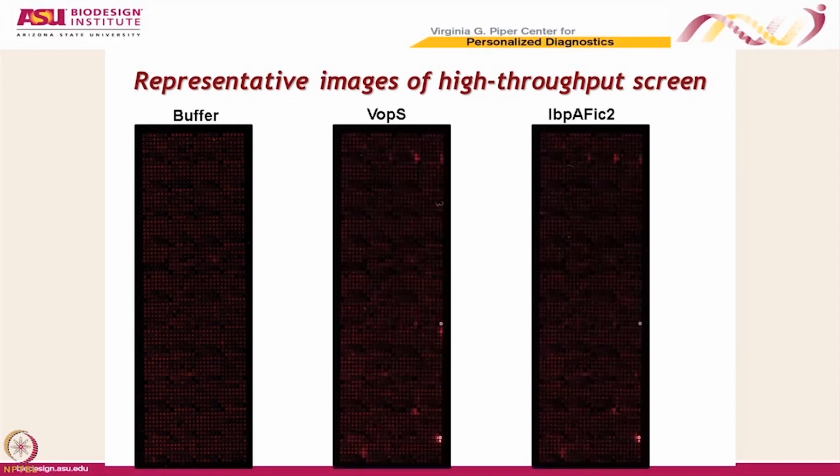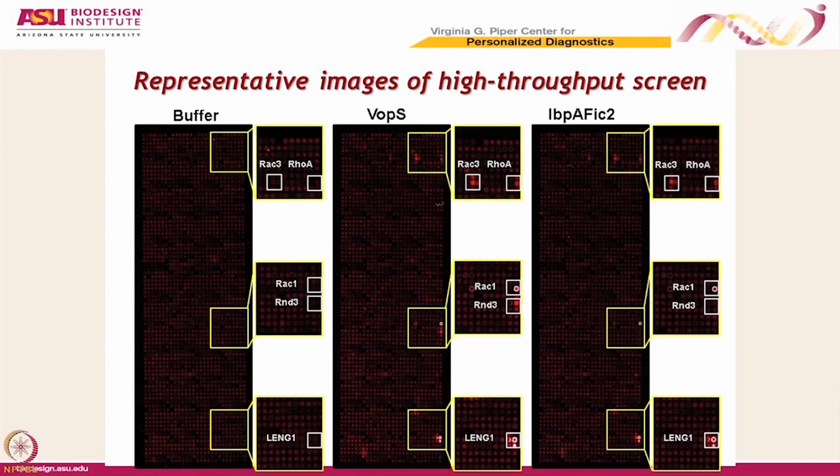When he treats with those guys, can you see that? All of a sudden, a few, not very many, but a few spots, like these guys right here, start lighting up. That's kind of the result that you're hoping for, right? When you're a researcher in the lab, when you're a graduate student in the lab, and you see only a few spots light, that's what really gets you excited, because if everybody lit up, then you know there was a lot of background and it probably didn't mean anything. But if only a few selective ones light up, that's a sign that you really found something. So this is what those spots look like, and of course these are the identities of those spots. You can see that they have very clean signals, right? And of course you don't see those signals over here on the control.